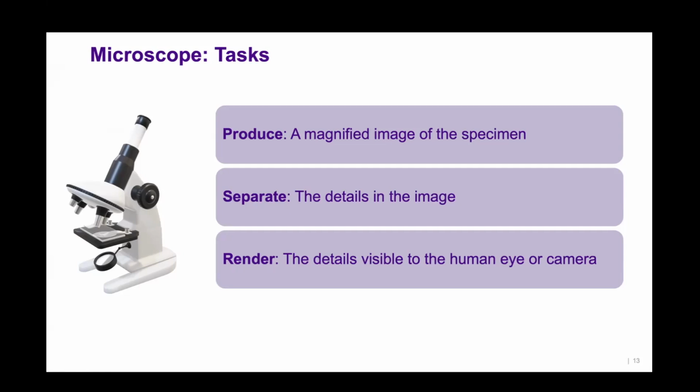And then you analyze. The only difference is they all have lenses, and the lens may be quite different. They have a source of light, and the source of light can be different. The way the images are captured can be different. But the overall principle of all microscopes is the same.